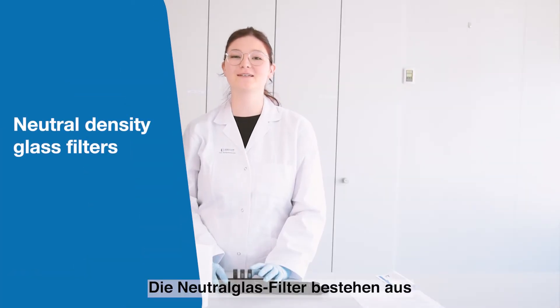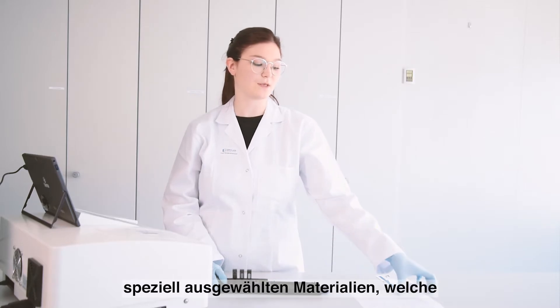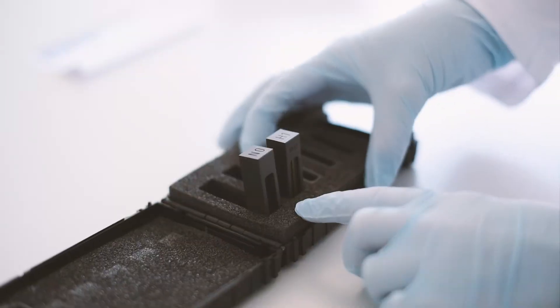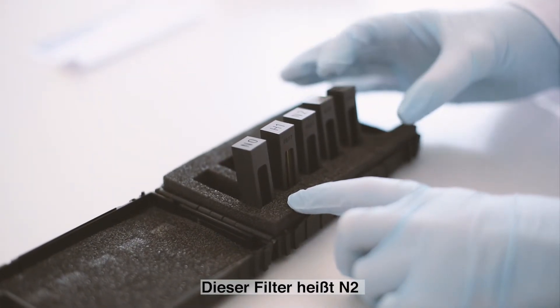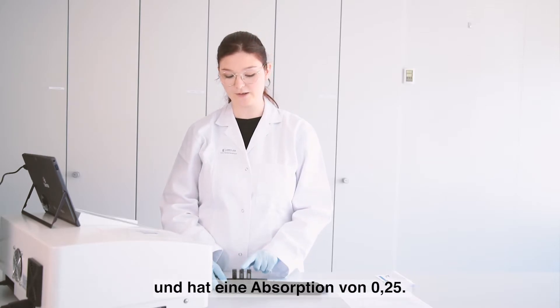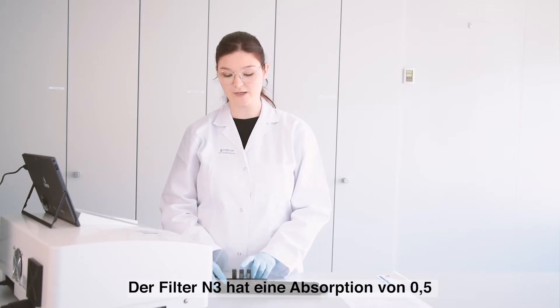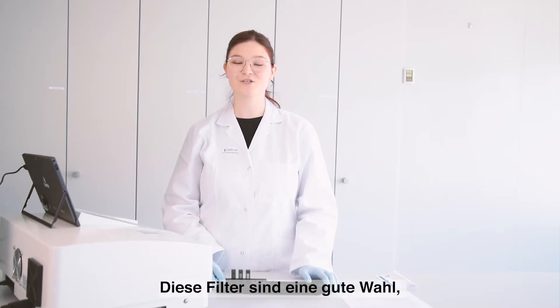These neutral density glass filters are made from specially selected filter materials and they come with a certificate. The filters are called N2, which has an absorbance of 0.25, N3 which has an absorbance of 0.5, and N4 which has an absorbance of 1.0.